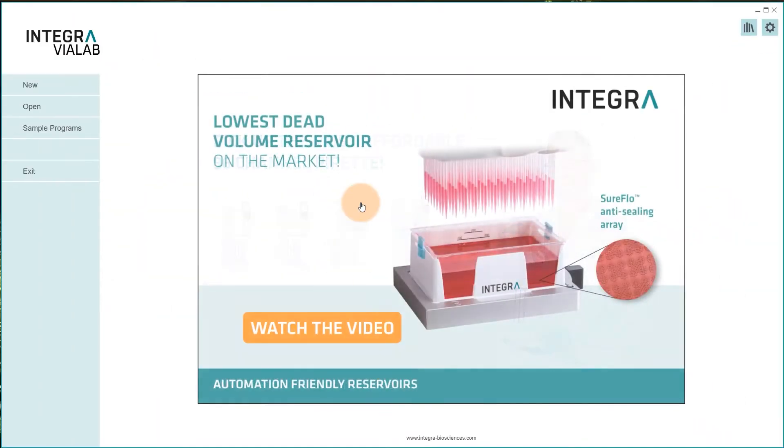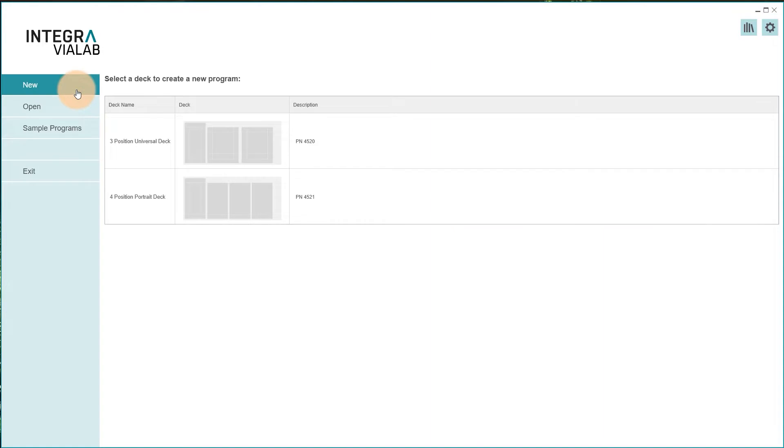Click on new and choose between one of our two standard decks. In this example we pick the four position portrait deck.